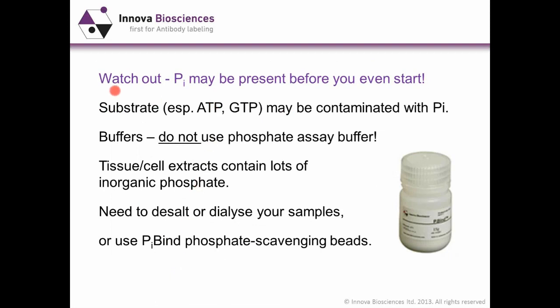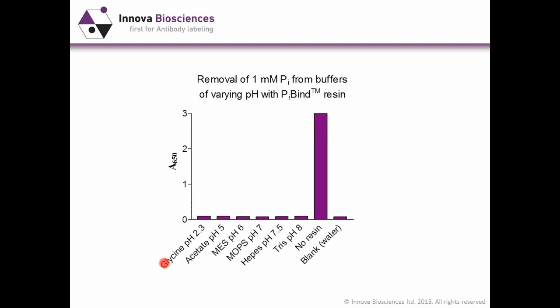Another thing to watch out for: you may have PI in your system before you even start your assay. The substrate — especially ATP or GTP — may be contaminated with PI, so you need high quality reagents. Don't use phosphate assay buffer, as you'll get a severe interference. Tissue and cell extracts also have a lot of inorganic phosphate from the cells, so you need to desalt or dialyze your samples. Alternatively, you can use PI-bind resin, a phosphate scavenging resin, to remove contaminating phosphate from buffers or samples under a wide range of conditions.